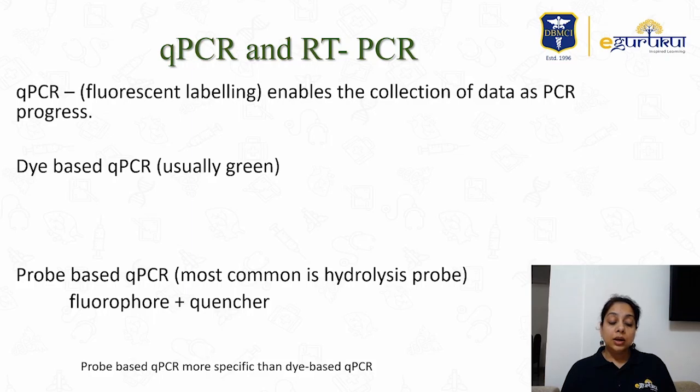Now there is one more term, qPCR. What is qPCR? qPCR is a quantification term, because when you are running the thermocycler, you are increasing the amount of DNA. But how will you know how much DNA has been increased so far?